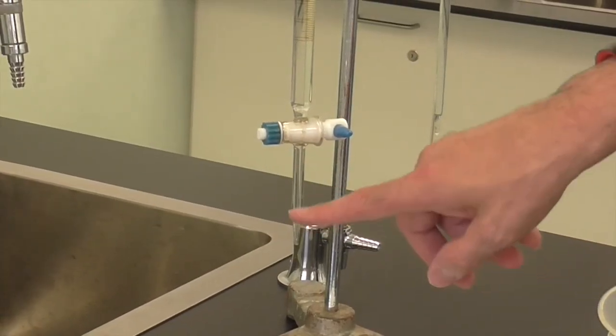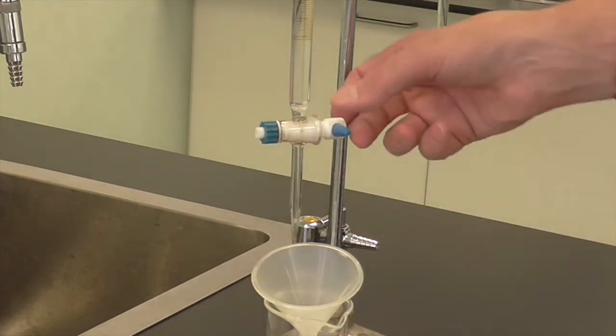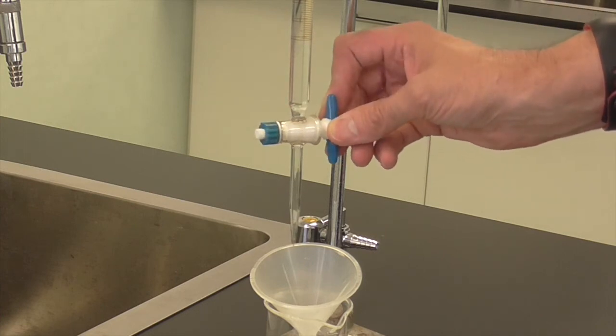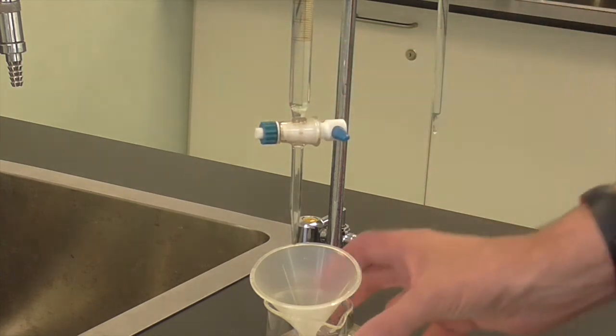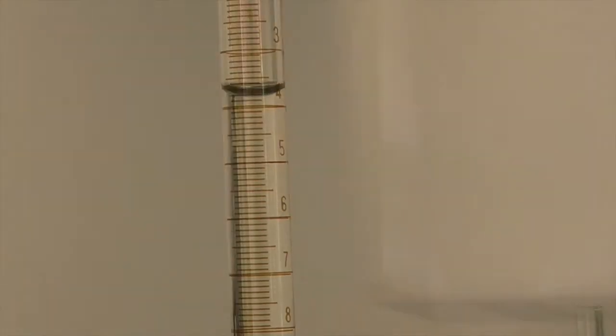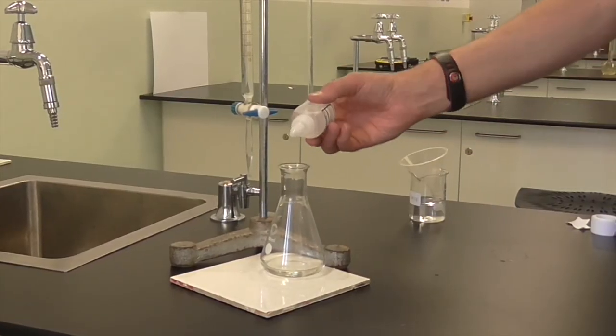Before using your burette, check for an air bubble in the bottom. To get rid of the air bubble, place the beaker of base underneath and gently open the stopcock and close it. That will get rid of the air bubble down the bottom so we have the right volume in the burette. Read off your initial value, in this case 3.8 mils. Add several drops of indicator, in this case phenolphthalein.